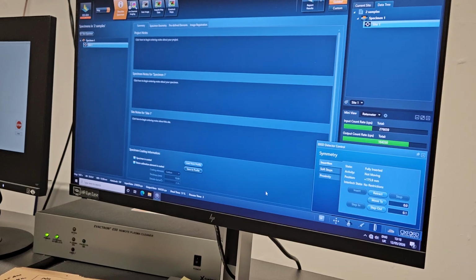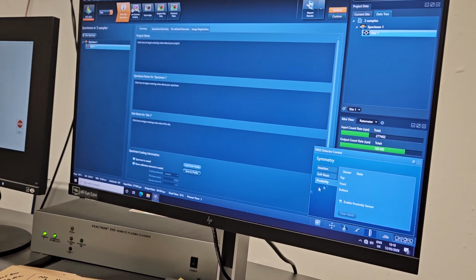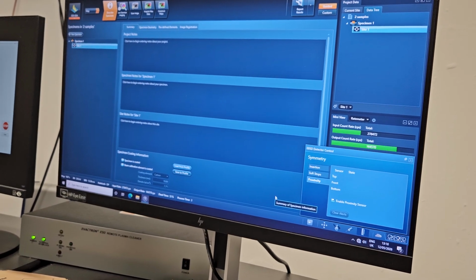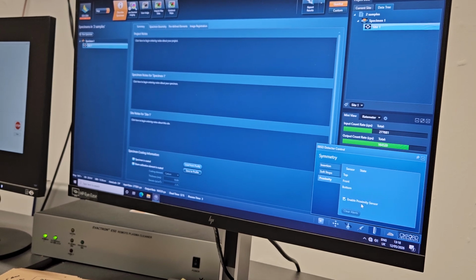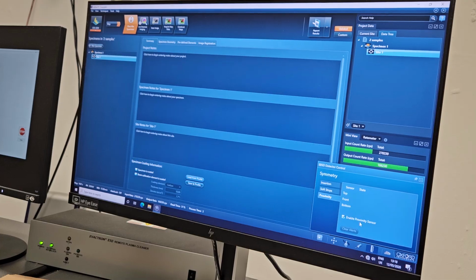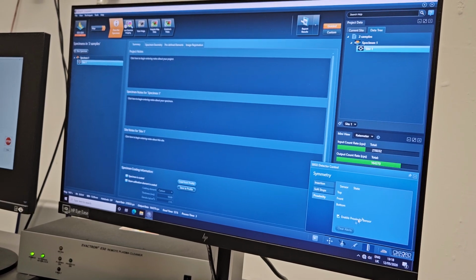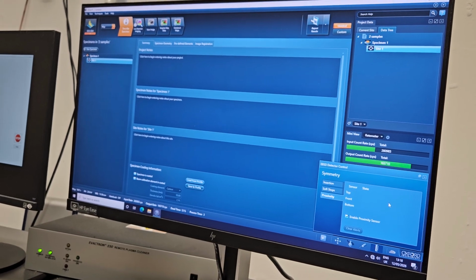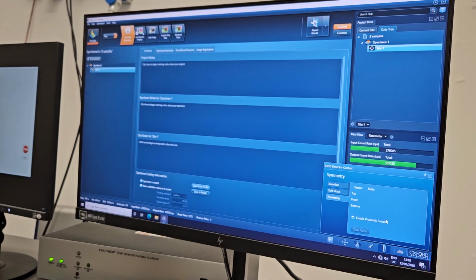Do you have to do anything with proximity? Proximity is always on when it is inserted, but there are some idiots who first disable it and then insert.